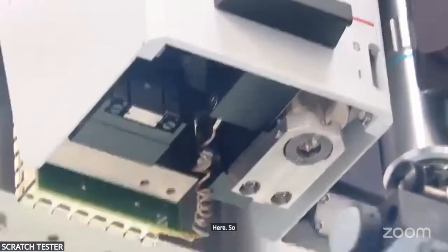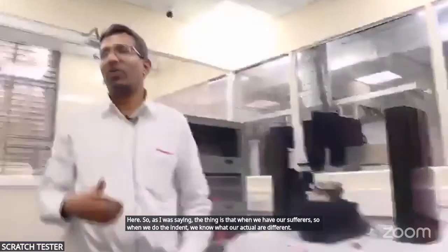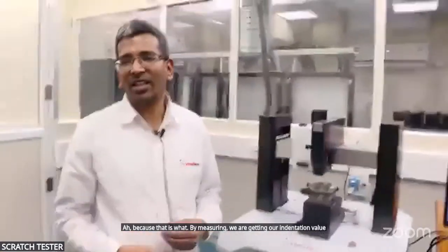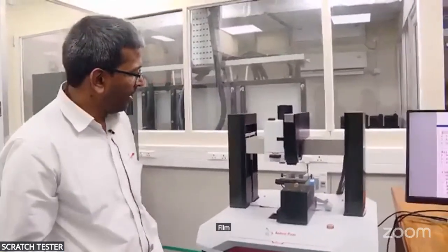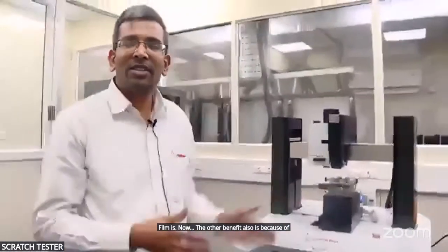So as I was saying, when we have our surface and we do the indent, we know what our different H's are, because by measuring we get our indentation values, like HC, Hmax and everything. We don't have any error. So the benefit is that you are always sure the values you are getting do not have any error and are more correct, and you are getting the actual property of your film, the hardness of the film.